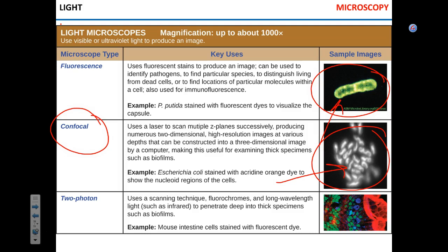Confocal microscopes are fairly expensive. I believe the lowest price for those is about 50 grand. So usually this equipment is bought for the department or more often for the institution. There can be several microscopes placed in so-called core facilities. So when you need it, you go there, you pay, you use it.